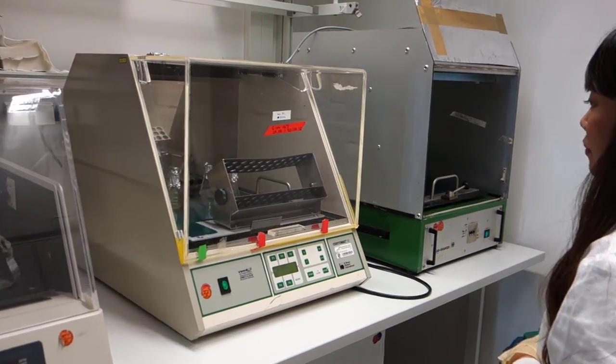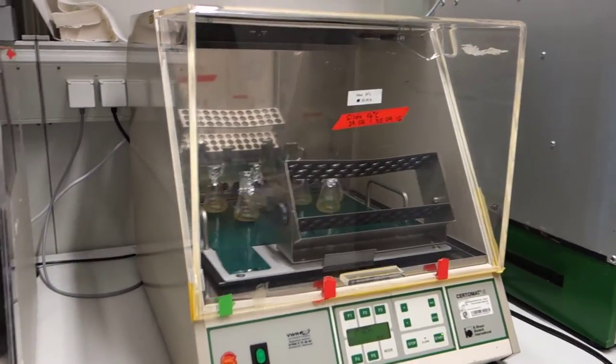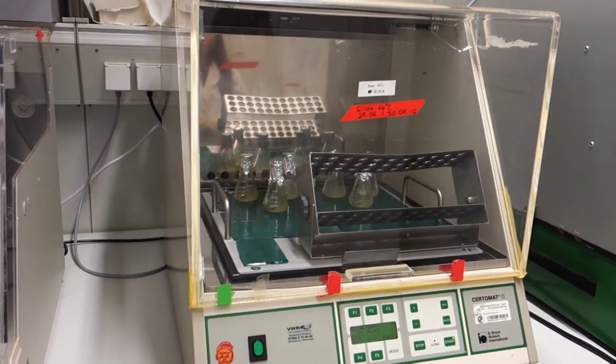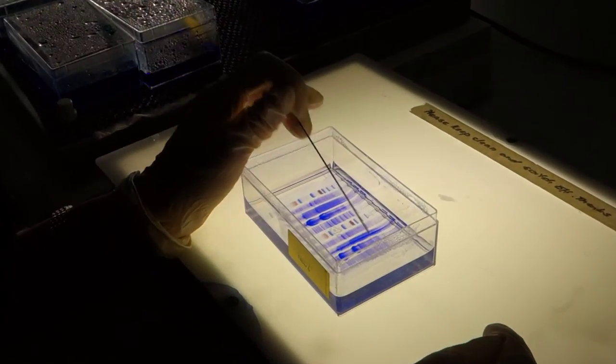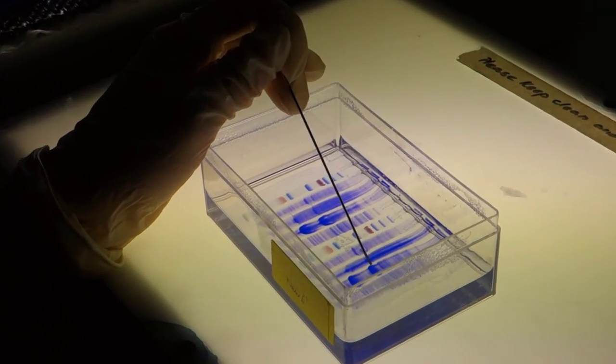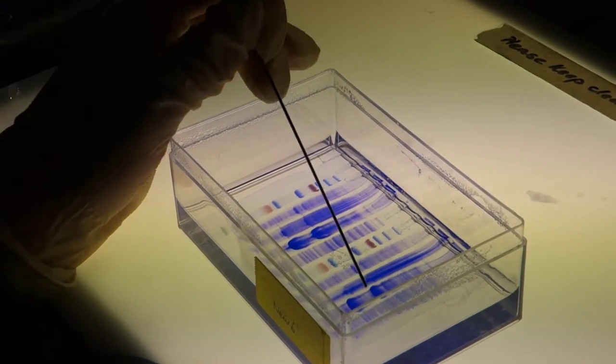We test the expression level and the solubility of the protein at a small scale first. Later, we check them on the SDS gel and choose the best condition for large scale expression and further purification.